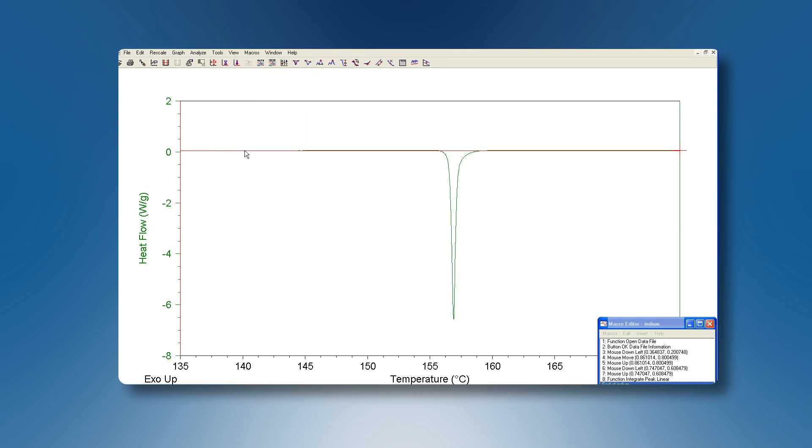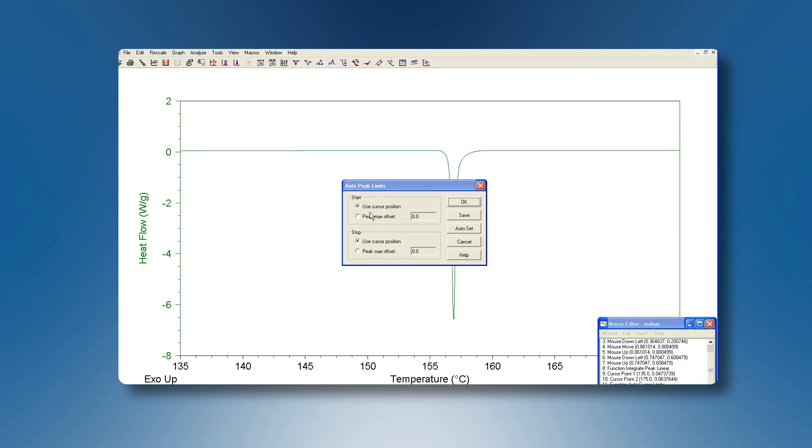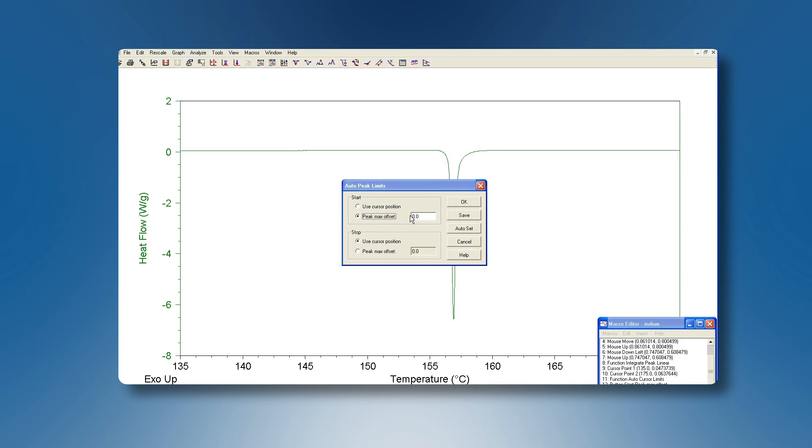Right-click on the mouse and select Auto Limits. This function is particularly useful to analyze an experiment on the same material but where the peak maximum temperature might vary a bit. The peak maximum is automatically searched for and as integration limits you define an offset to the lower temperature and one to the higher temperature starting from this peak maximum.